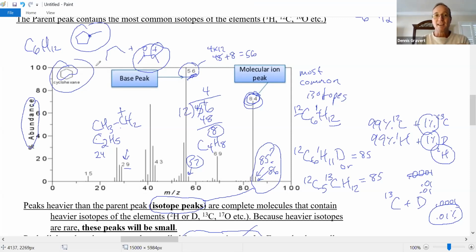So already, if you analyze the mass spectrum of this, we should see a different base peak. We're going to get a different looking mass spectrum. It's going to be a fingerprint for this molecule. They'll be different from the fingerprint, all these peaks, these heights, this distribution of peaks, different from the fingerprint for cyclohexane. Cool.